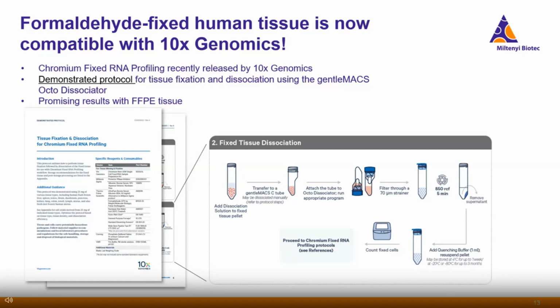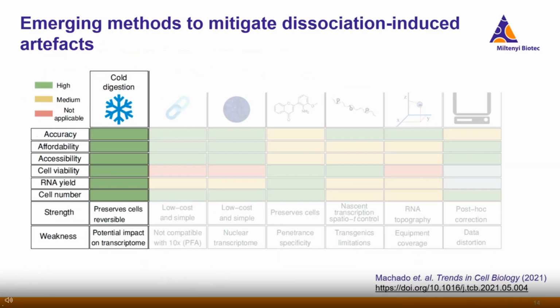So this is all very new, and Miltenyi Biotec has not had the chance to develop a validated fixed tissue dissociation protocol, but we are working on it. So I'm really excited to see how the scientific community takes advantage of this technological advancement. But for now, we'll have to move on to more established methods.